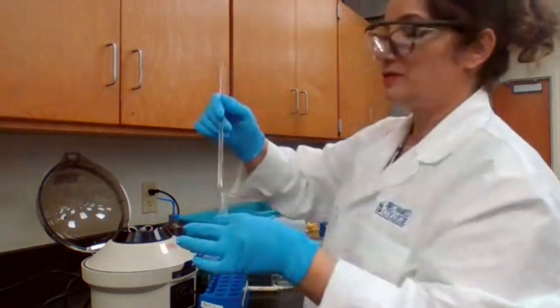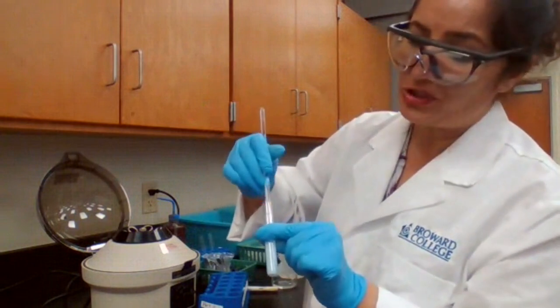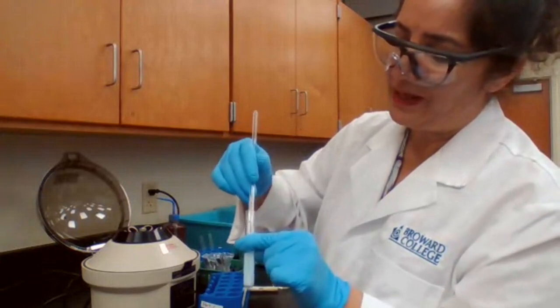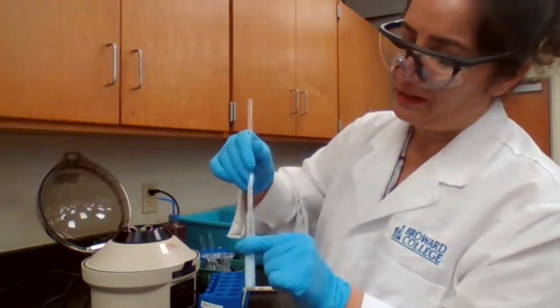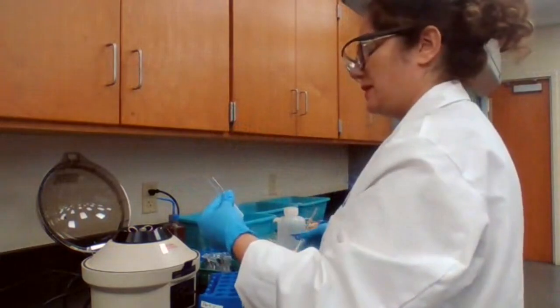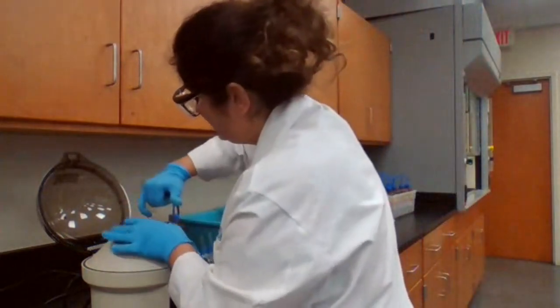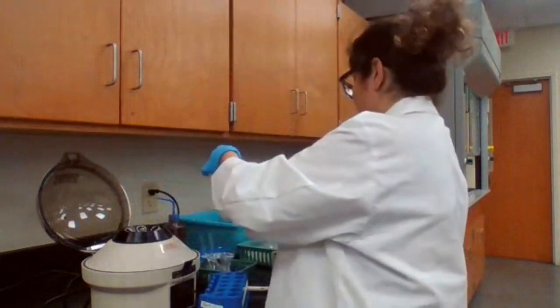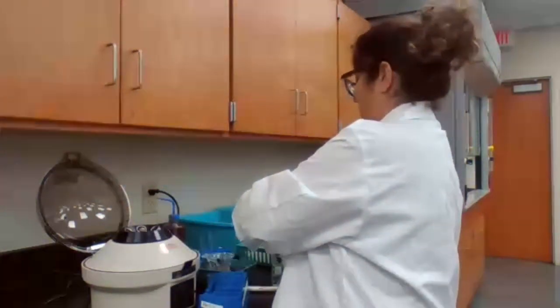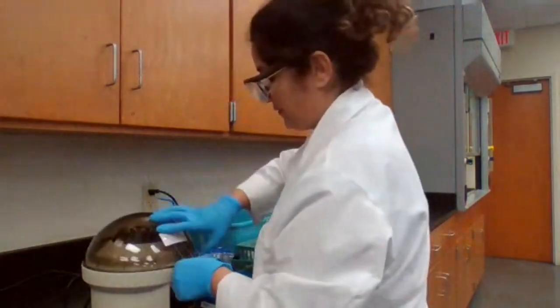Make sure that if you're using a stirring rod, your stirring rod is clean before each use. You clean it. You don't trust that someone left it, that nobody touched it, especially when you're working with someone else. Place it in the centrifuge. Make sure the other test tube has the same amount of water to balance the mass, and centrifuge.